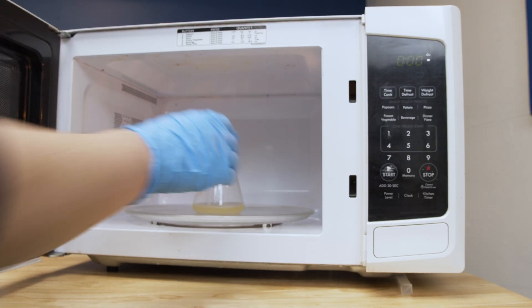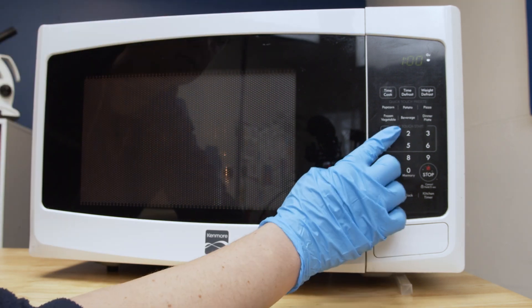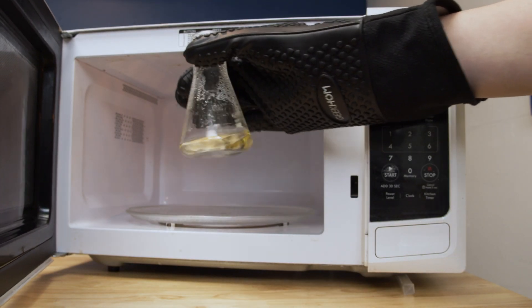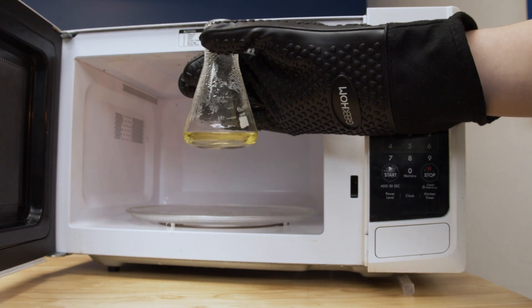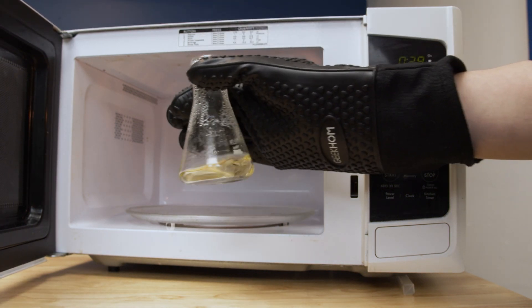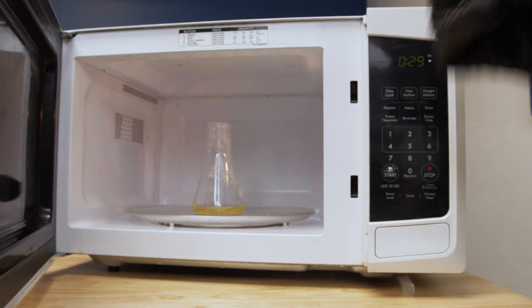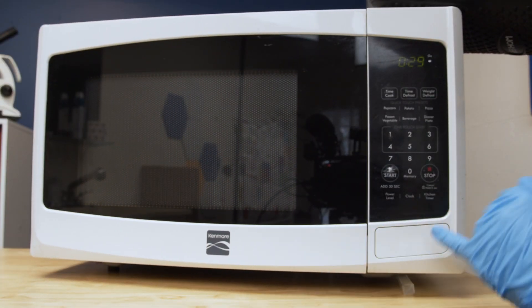Heat in a microwave for 60 seconds or until the solution boils. Keep an eye on it to make sure it doesn't boil over. Swirl using a heatproof mitt to make sure that the solution is well-mixed. Make sure all the agarose crystals have dissolved. If agarose crystals remain, microwave for another 5 to 10 seconds, then check again.